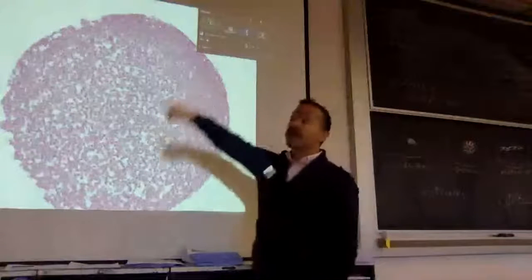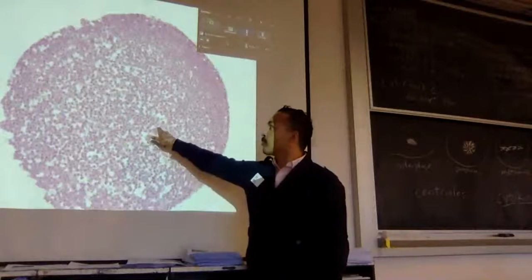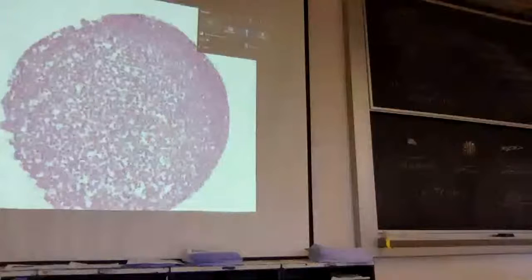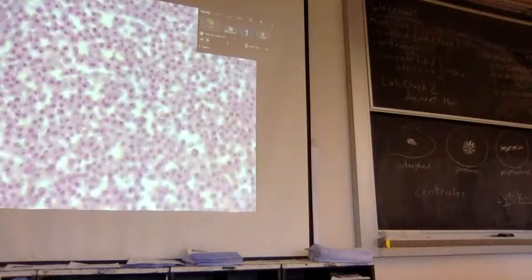This whole thing is the embryo, it's not a cell. These are all cells, all these little things, and all the dark parts, those are the nuclei, the chromosomes. So we gotta look closer. So this is at 4x, I'm in focus. I switch to 10x objective, 100x total. Here's the fine focus, there it is.